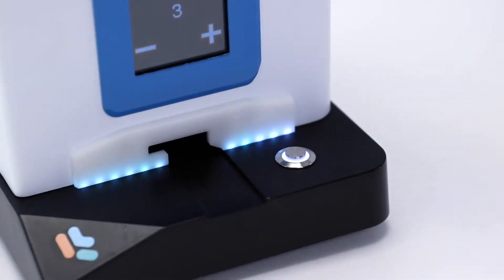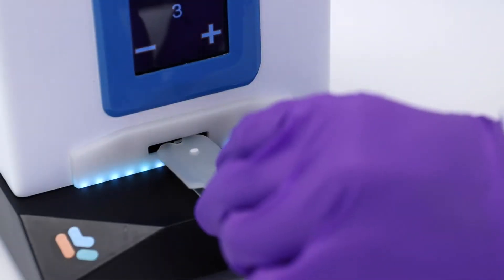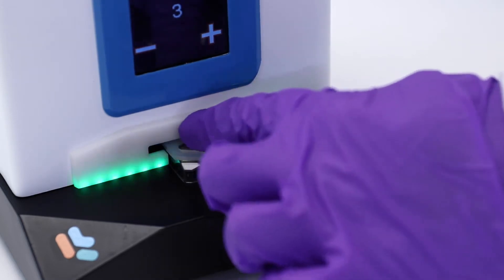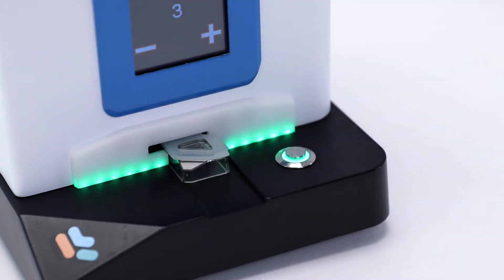With typical RNA LNP materials, Spark cartridges are designed to mix with a 2 to 1 aqueous to organic volume ratio followed by a 1 to 1 dilution.